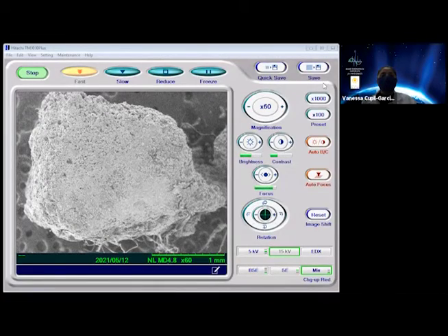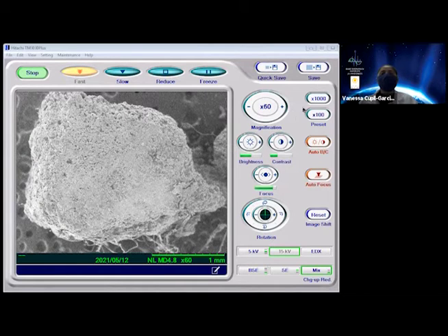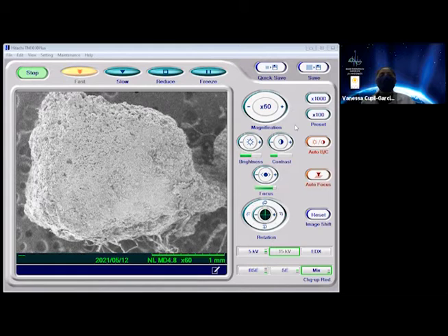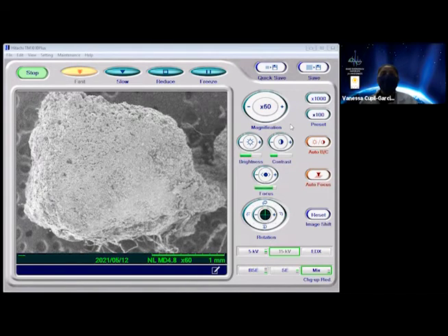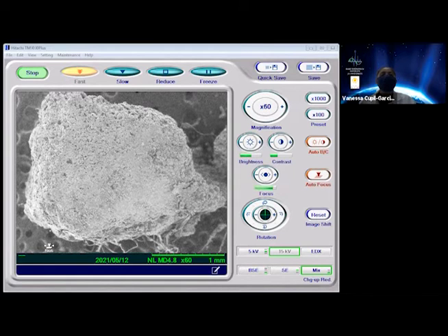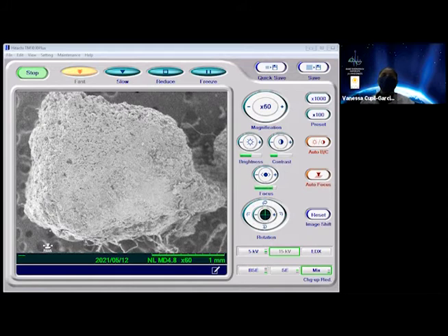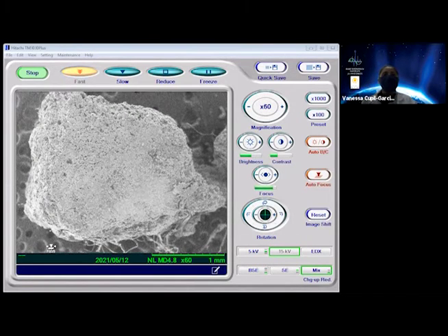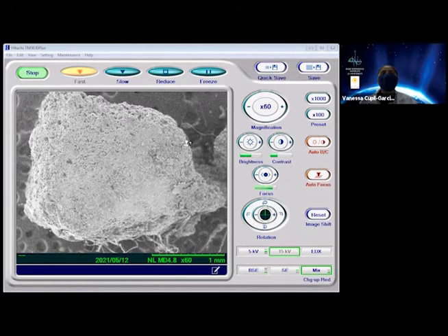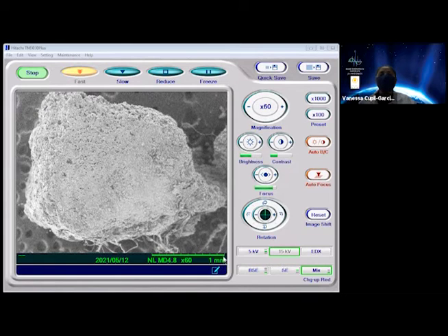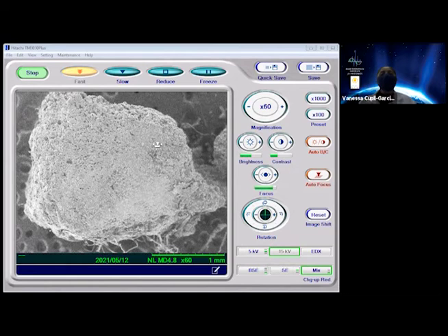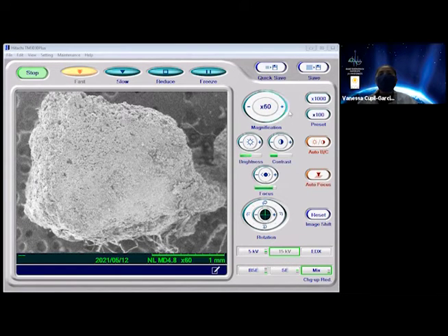On the screen right now, we have our second sample, which is the piece of wall. And right now we're 60 times magnified on the scanning electron microscope. When I showed you the samples, we were twice or 2x magnification. So right now we're 30 times more magnified than previously. We can see here our sample. And then back here, you're probably wondering what this is with these holes. So this is a carbon tape that's sticky on both sides. So it can stick to our sample holder and to our sample itself. And both of them actually get coated when we put them in the sputter. And the gold coating is around 10 nanometers. So a nanometer is a millionth of a millimeter. And for reference, your DNA, if you measure it across the skinny side, it's 2.5 nanometers. So this is what the piece of wall looks like under 60x magnification.